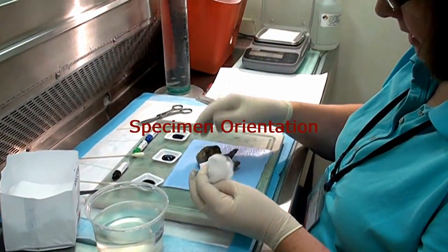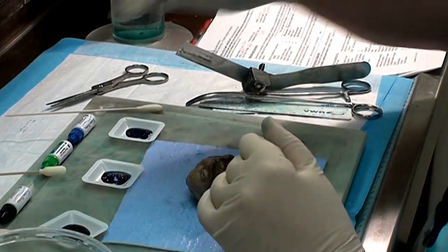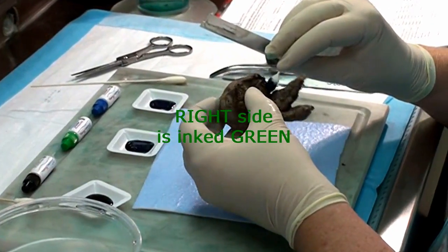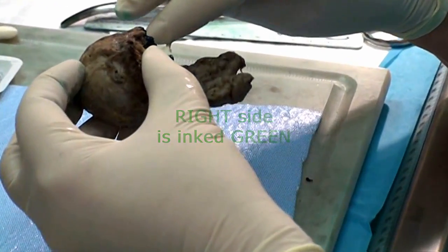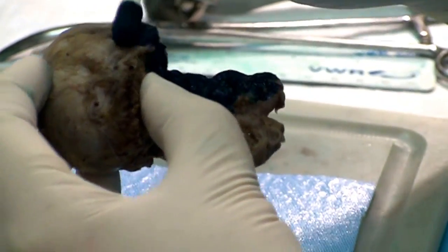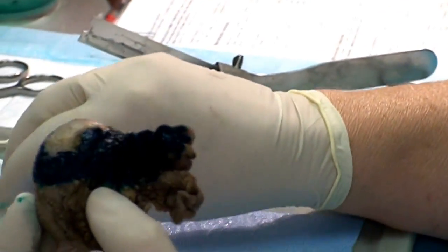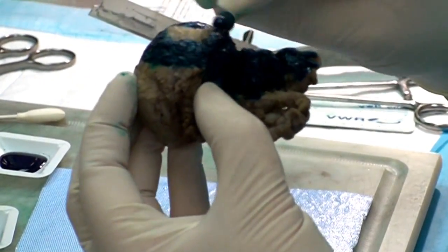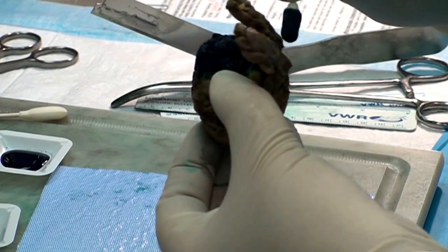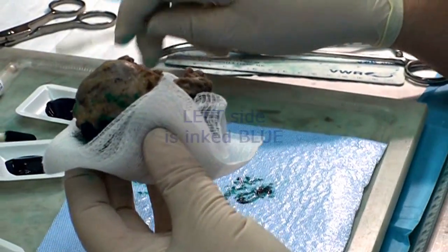We're going to lay the specimen down with the seminal vesicles pointing towards you. Now I'm going to take the green ink on the right side — the patient's right side — and do just the right side of this gland. We use these little foam swabs to apply the ink. And now I'm going to put blue ink on the patient's left side.